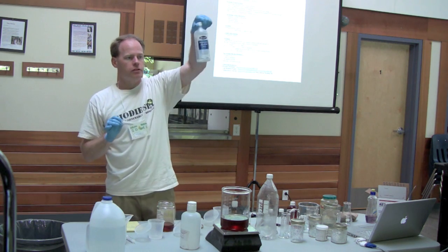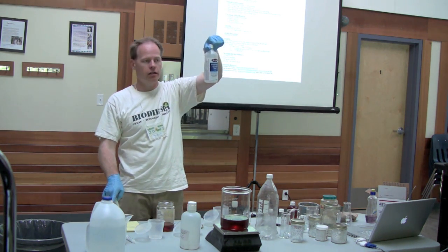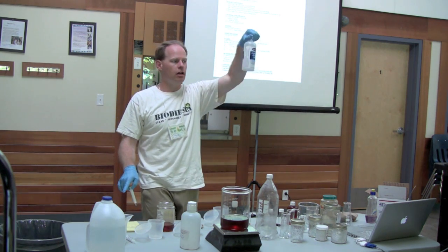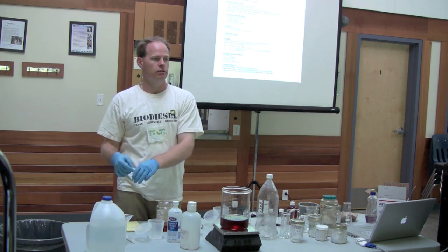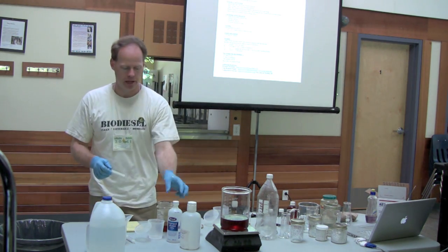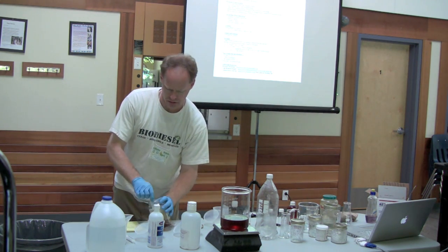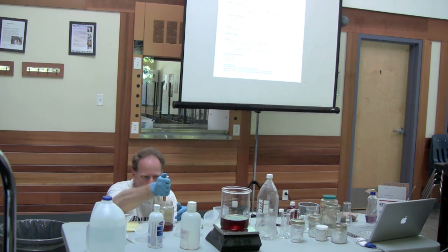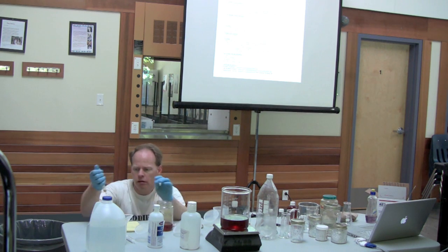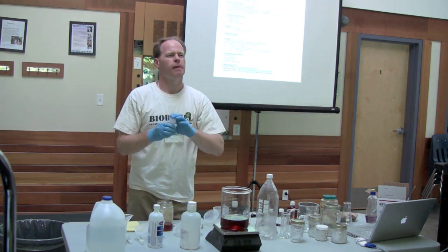If this alcohol was not brand new, there is a way to test your alcohol to see if it is sort of acidic, because alcohol gets old and tends to go acidic. That's to do a titration without adding the oil. You just start putting it in and then you can adjust it. I'm assuming this is new, and in the interest of time, we're going to forego that step. I'm going to do a milliliter of oil. In it goes.